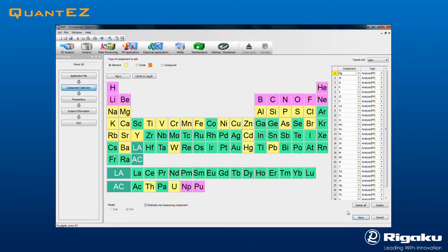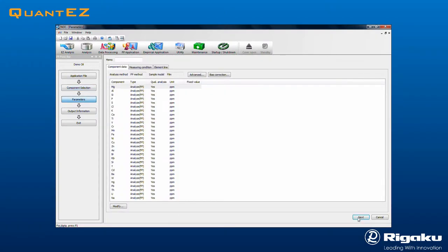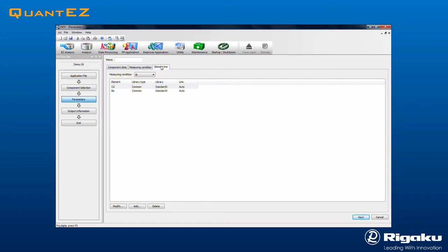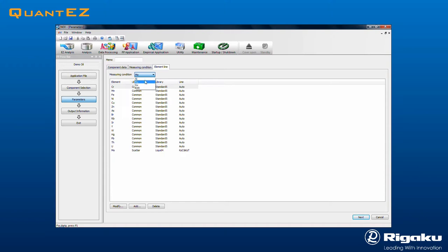Clicking Next brings up the Parameters screen, where measurement conditions and line assignments are automatically set for every component. Tube voltage and current are set automatically. Only the measurement times for a given condition might need to be modified. Measurement atmosphere, either air or helium, may be selected. Vacuum is not an allowed condition for oils. Note that the Elemental Line Associations are marked as Auto, which means that Rigaku profile fitting will be employed.